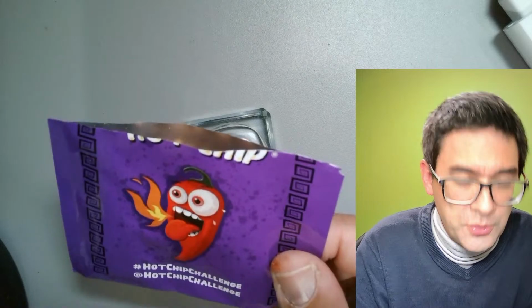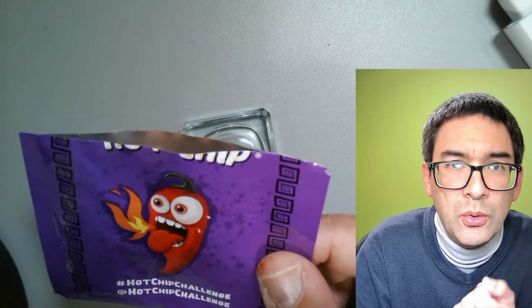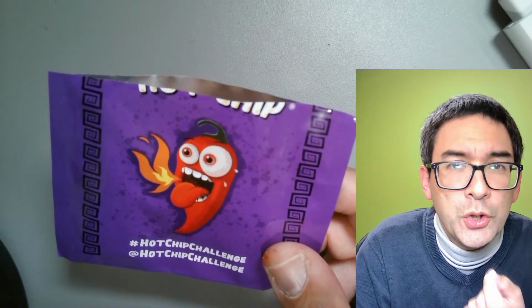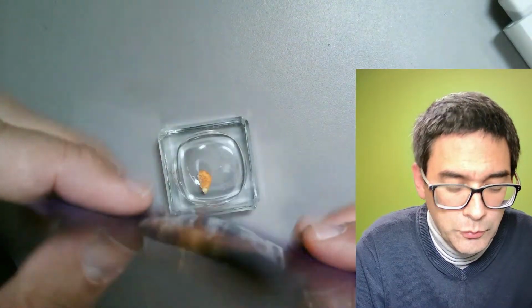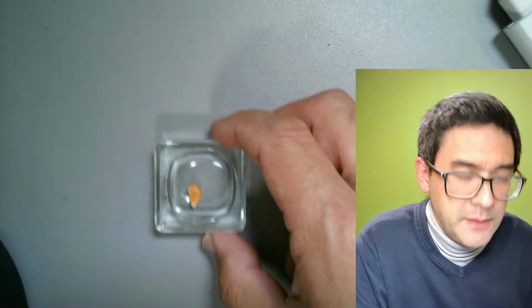I'm a little bit concerned about something else, though. It also tastes a little bit salty. I'm able to taste the salt because I only used a small amount of the spice. And if there's salt in there, I have to be careful because this actually changes the osmotic balance of the organism. So that's it. Okay, I'm going to put the rest back here. And now let's give it a try. Okay.